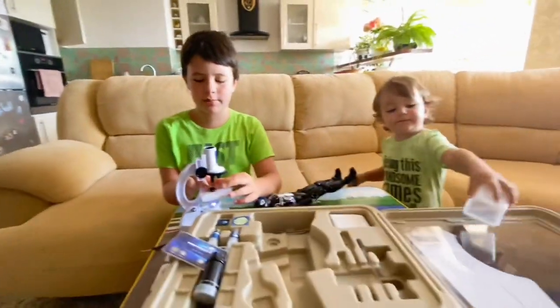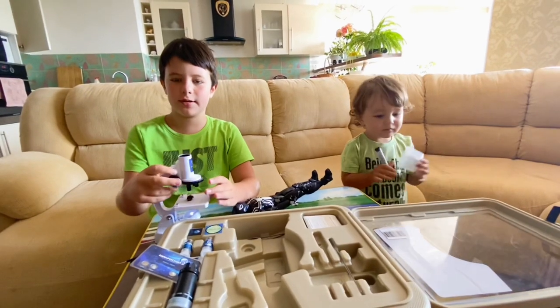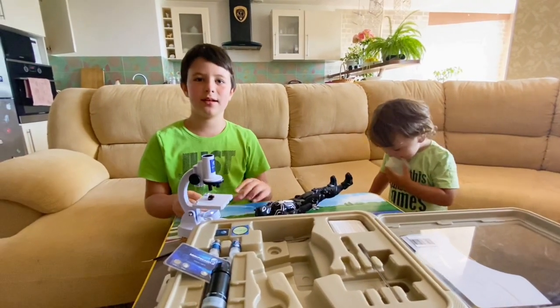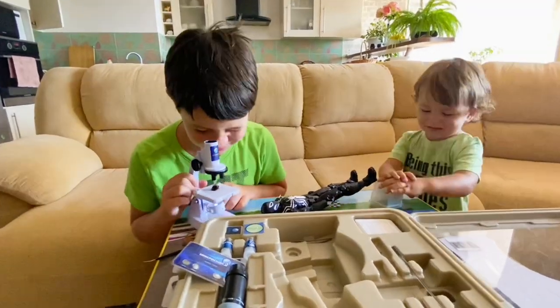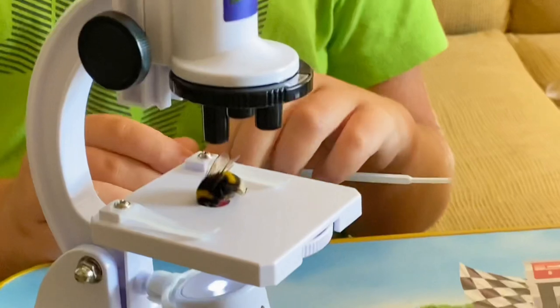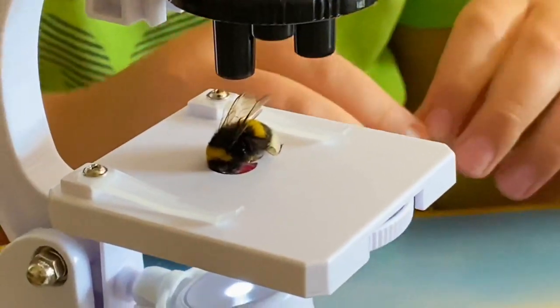Now we're not finished microscoping the bee — now we can actually look at the bee. It's a bee. I can see wings. I can see things like white wings.